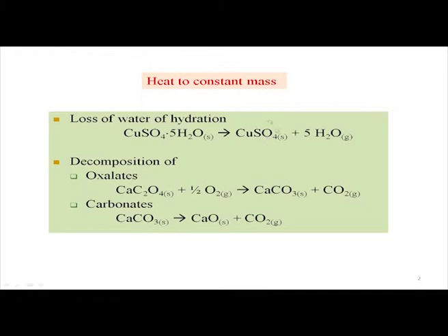But if we want to prepare the corresponding copper sulphate in the monohydrate form and the anhydrous form, so this anhydrous form, when it gives up all 5 water molecules, is a colorless species. And these 2 things, now what we want to see, that the plots we have seen, these are basically the 2 important studies we can make for thermogravimetric analysis: the decomposition and degradation of calcium oxalate to calcium carbonate, and this calcium carbonate to calcium oxide.